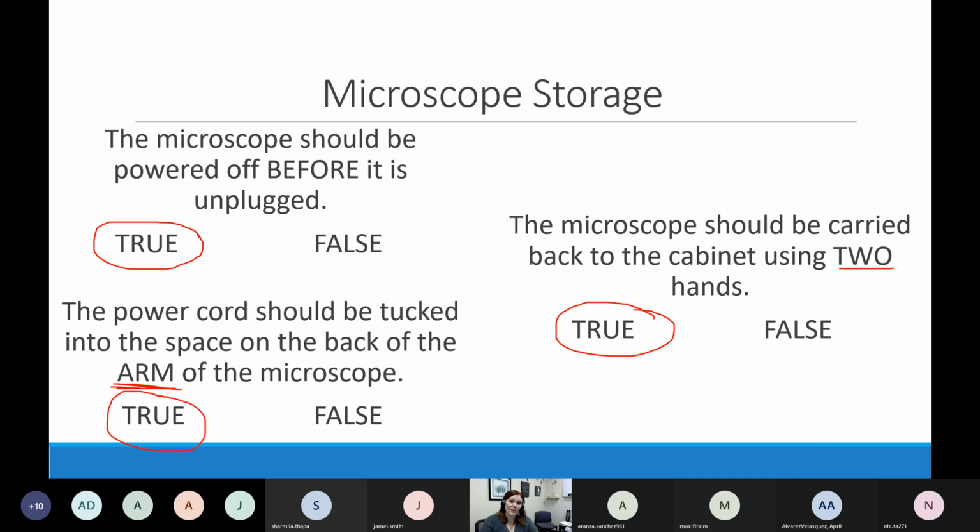That's called an oil immersion lens. For anybody in microbiology, that is going to be your domain. You're going to spend all your time with that one. When you're looking at things that are even smaller than human cells, like bacteria, for example, or yeast, you would want to use that even higher power objective lens. It's called oil immersion on purpose. You have to put a little drop of oil on your slide. It uses that oil to make sure that the light gets into the really, really long objective accurately.